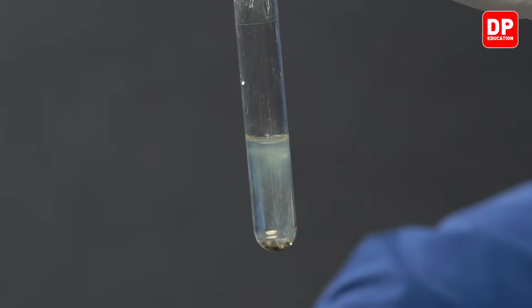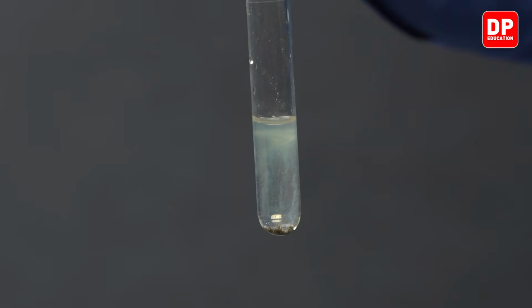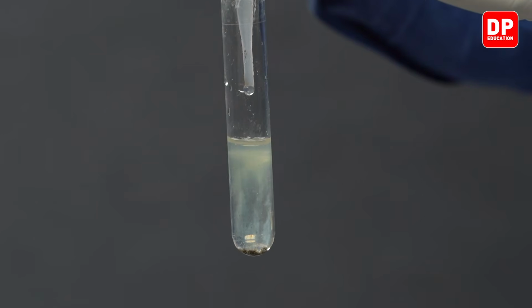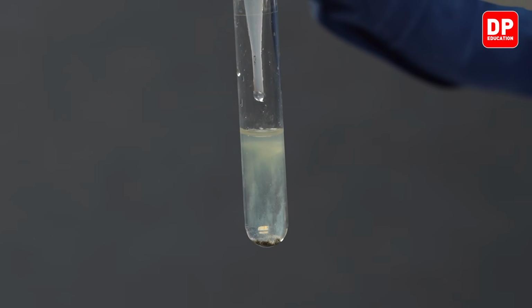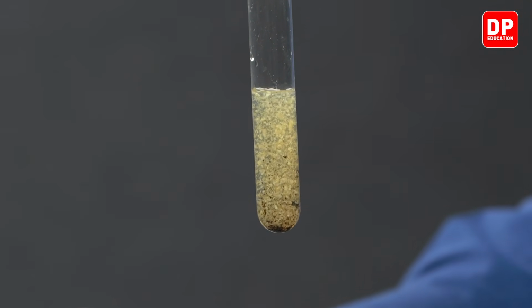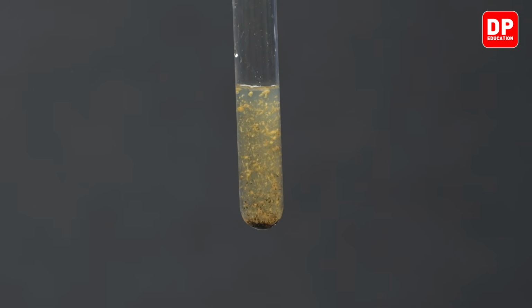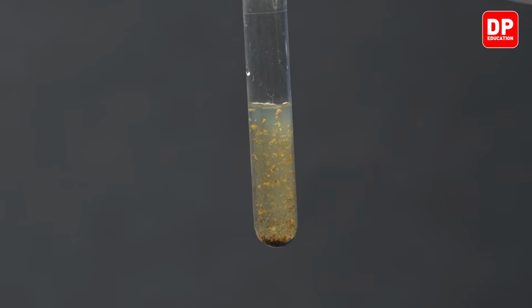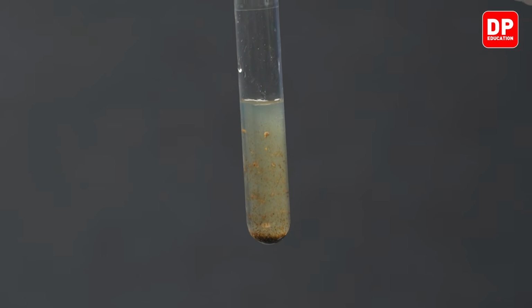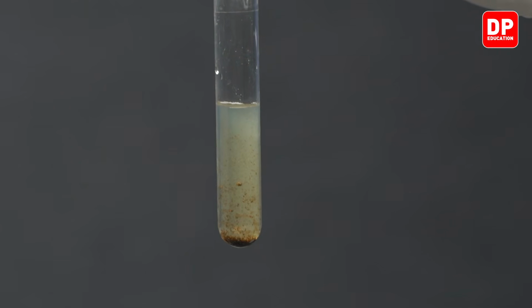So as soon as we take a small amount of silver nitrate, and if you add silver nitrate now, you will see the formation of a white color precipitate first. And that white color precipitate gradually changes its color and turns into a brown color precipitate and to a black color precipitate.